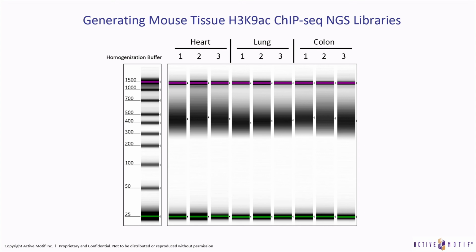So at this point, this process, 4 meters per second for 20 seconds homogenization with a 5 millimeter bead and subsequent PIXUL sonication, represents a new high throughput method of homogenizing mammalian tissues that leads to high quality chromatin that can be used in ChIP-seq applications. These libraries are currently being sequenced, so we're very excited to see what data comes out of this, and then hopefully apply this process to human tissues so that we can really start to answer some clinically relevant and interesting questions and develop new targeted personalized therapeutics in the epigenetic space, or help labs do that.